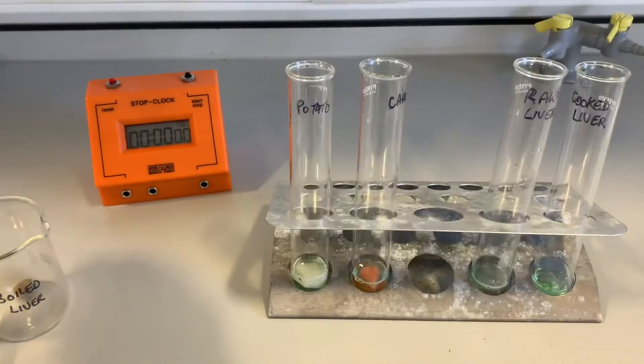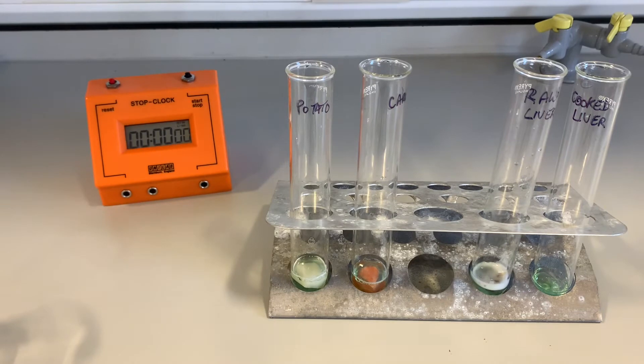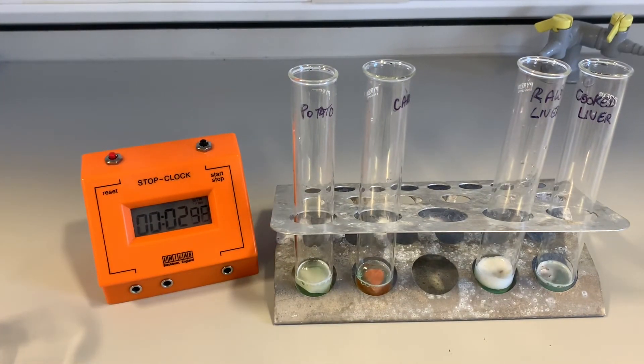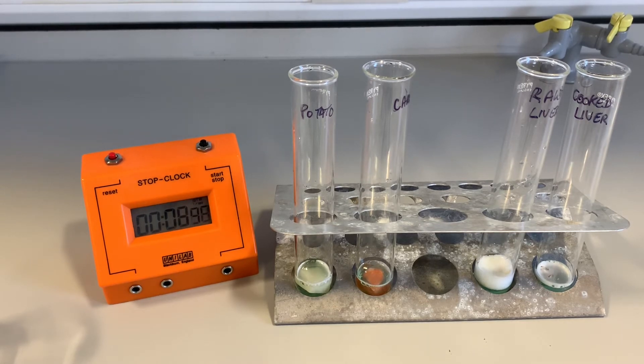We are going to put some raw liver into this one here, and we're going to pop some boiled liver into the one at the end. Now already you can see we are starting to see froth. Remember the froth is a sign that the hydrogen peroxide has been broken down and the oxygen gas is forming. We're going to leave that now for five minutes, and then we'll come back and using a ruler we'll be able to measure the height of the froth.